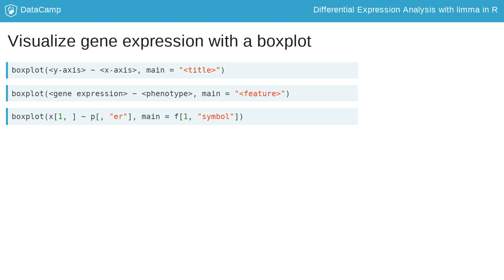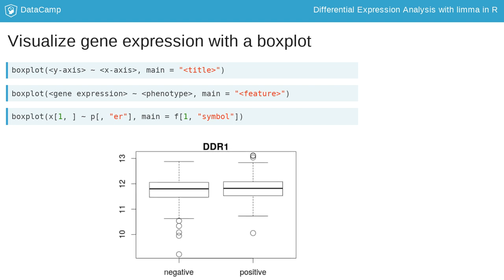Specifically, to plot the first gene of the breast cancer data, I subset the first row of the expression matrix for the y-axis, and I select the column ER from the phenotype data frame for the x-axis. For the title, I use the feature data column symbol, remembering to subset to only include the first row, corresponding to the first gene. This gene appears to be similar in both groups.